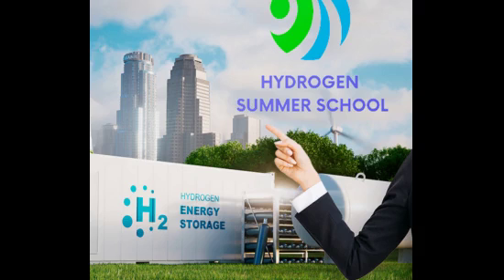Due to its inflammability and other potential hazards, here are some guidelines for safely handling hydrogen in a school lab. Supervision. Hydrogen experiments should be conducted under supervision of a knowledgeable teacher or lab instructor who is familiar with the safety considerations. Proper equipment. Use appropriate equipment designed for hydrogen gas generation and handling. This may include gas generators, gas collector setups, and gas delivery systems.